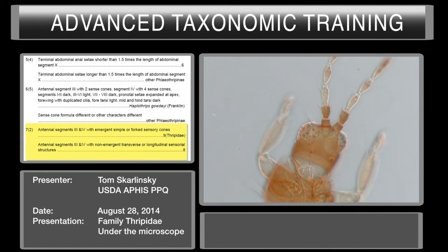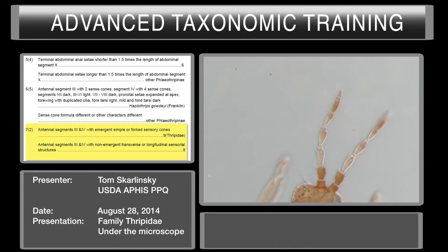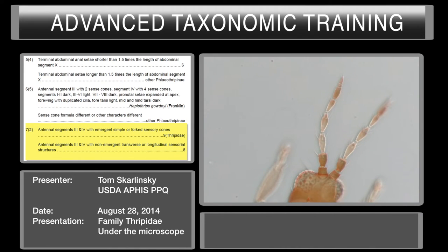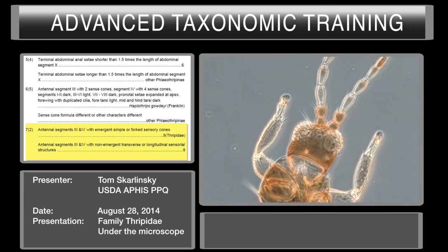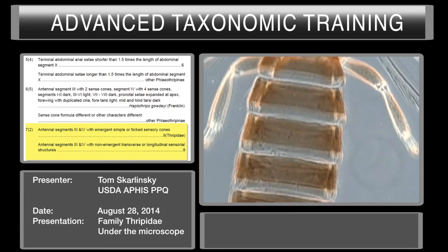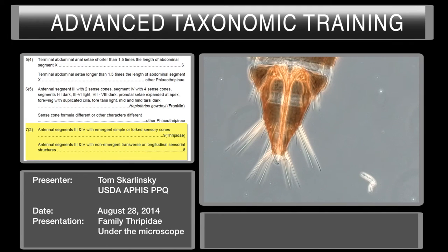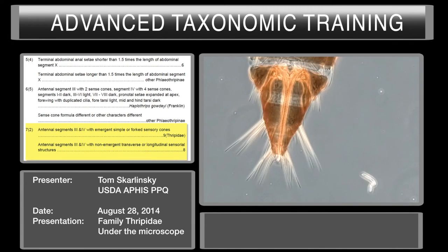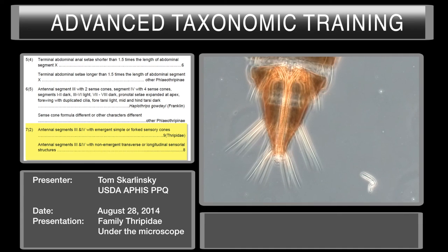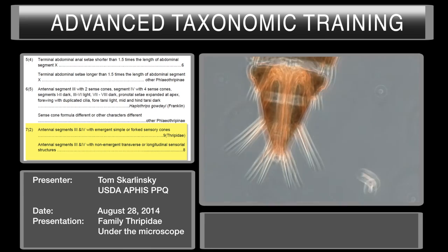So we've pretty much established that on this specimen we have the forked sense cones, and we have a conical terminal abdominal segment that doesn't fully enclose. So we have Thripidae.